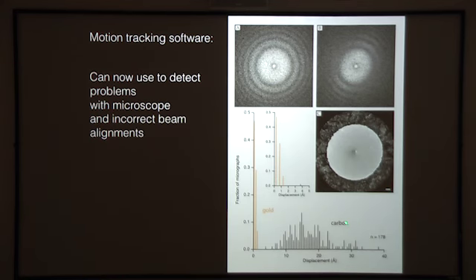So here we've plotted the MotionCor statistics for particles on carbon and on gold grids. And you can see that there's a really different distribution of the motion on the two supports. But you can also use this to evaluate your specimens and make sure that they're stable in the beam and optimal. So this can really be used as a diagnostic tool for both specimen and imaging quality.